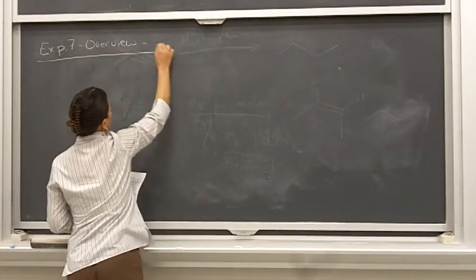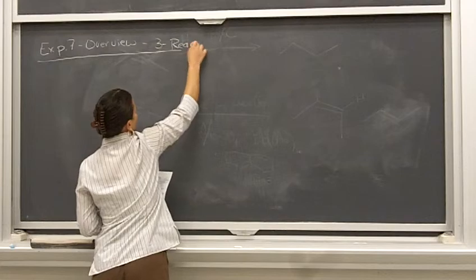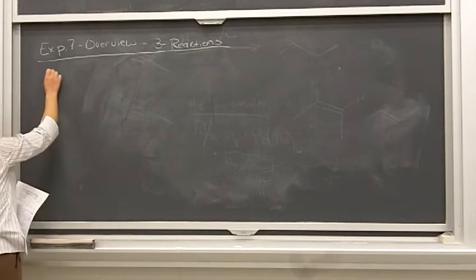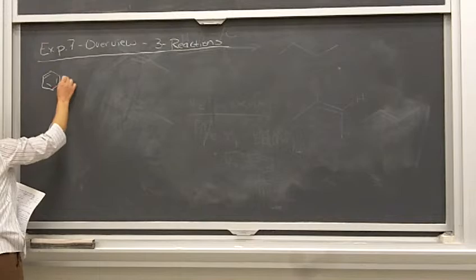We're going to be doing 3 reactions in this experiment, okay? So we're ramping things up quite quickly here. The first thing we're going to start with is ethylbenzene, all right? So that's what you're starting with this week.